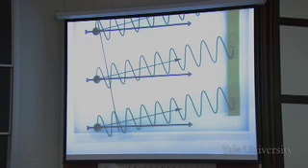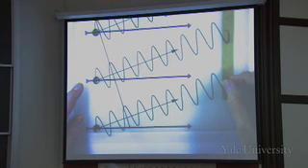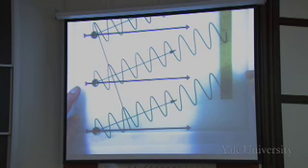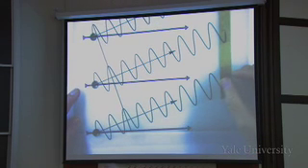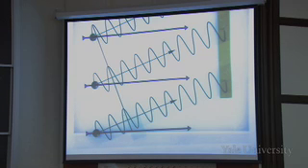Suppose that this were a very, very long line of scatterers, right? And the first 2, let's get to this place here where they're all exactly in phase. That'll obviously be a very strong angle. But suppose we looked at another angle that was close to that, but just a teeny bit off. So the first 2 are off by just 1 degree in phase. And the next one's off by 2 degrees in phase. Not much off, okay? So are we going to get pretty strong light coming out from that?